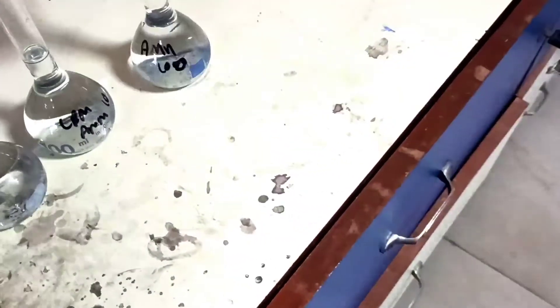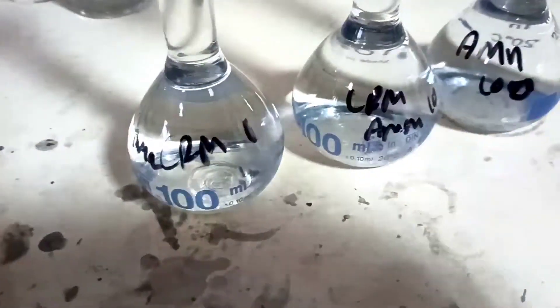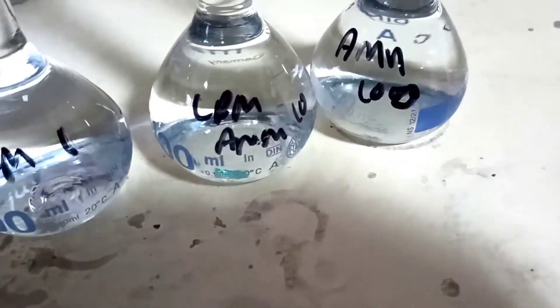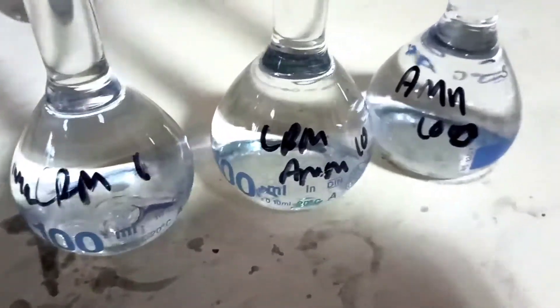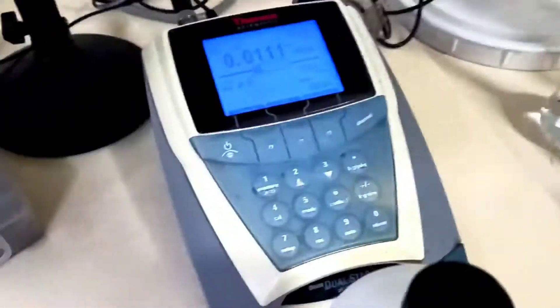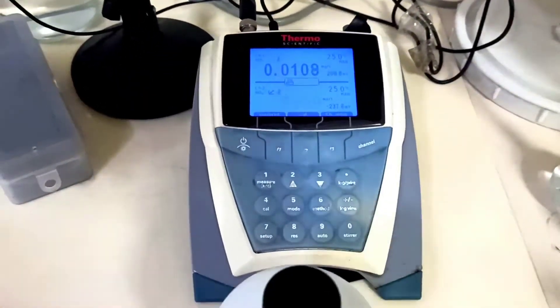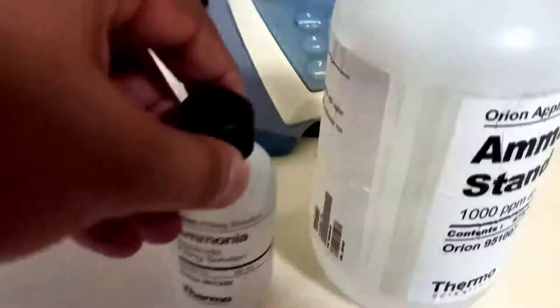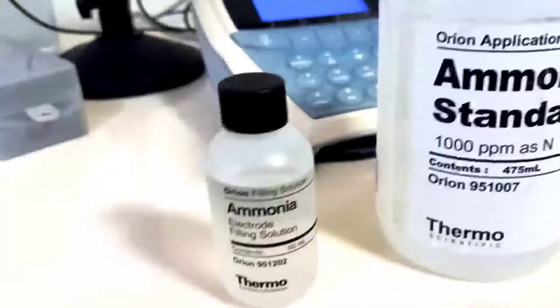We prepared three standards: 100 ppm, second is 10 ppm, and last one is 1 ppm. By using the N1V1 equals N2V2 formula, we prepared these three standards. The thousand ppm is our primary standard, also called the certified reference material, and it is approved by NIST.